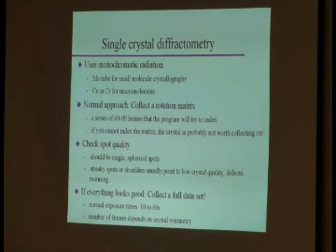Another thing, if your computer cannot index that matrix, it's probably not worth collecting on the crystal. Okay? Because if you cannot index your data, you cannot solve the structure. And there might be tricks that you can play, throwing certain reflections out. A better thing to do is look for a different crystal. Find a crystal where the matrix indexes cleanly. Okay?